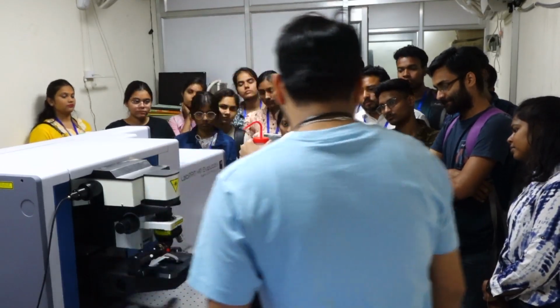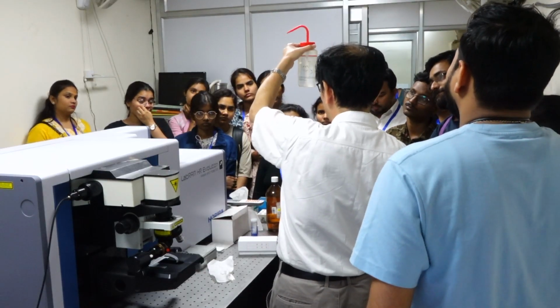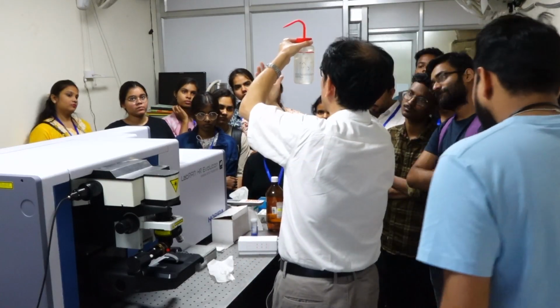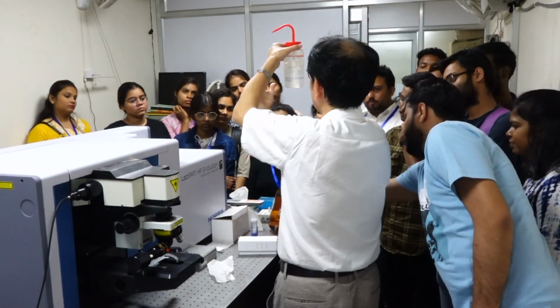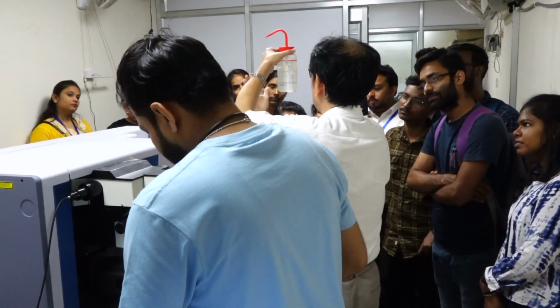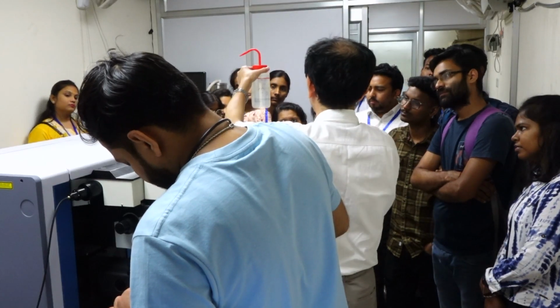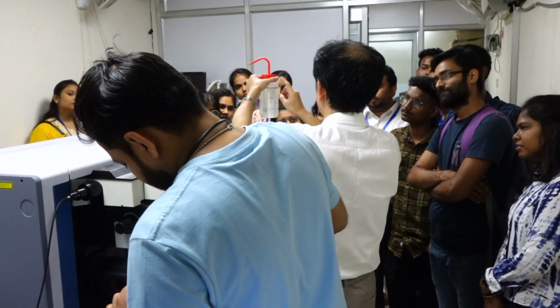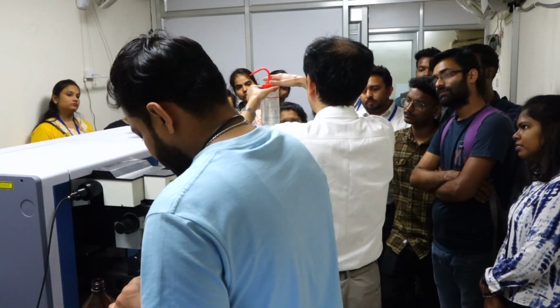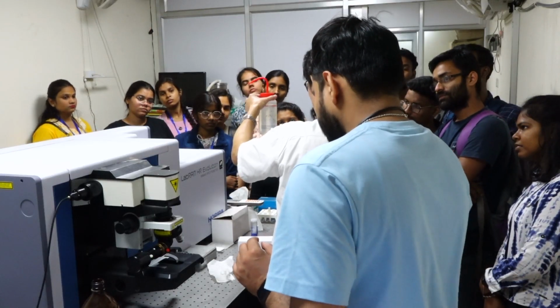When we measure the Raman spectrum, typically we irradiate the sample cell from the bottom and gather the Raman signal at the 90 degree. This is 90 degree scattering configuration. Why is 90 degrees good? If we catch the signal from this side, then strong laser line directly irradiates the detector. So it's not a good idea to detect Raman with the strong laser line.